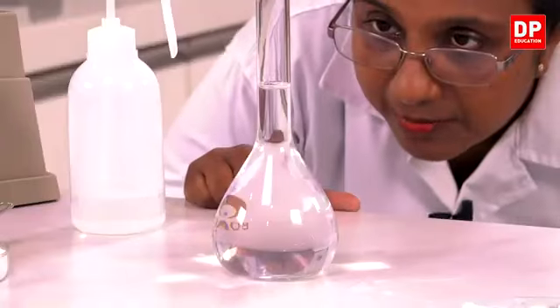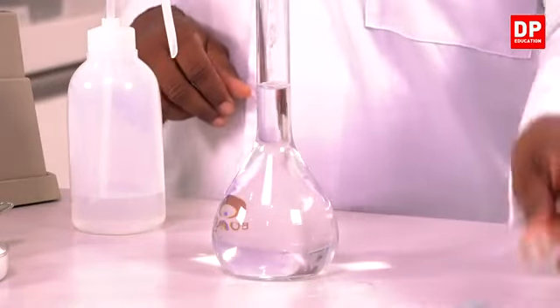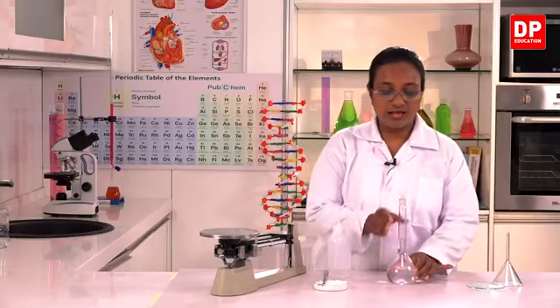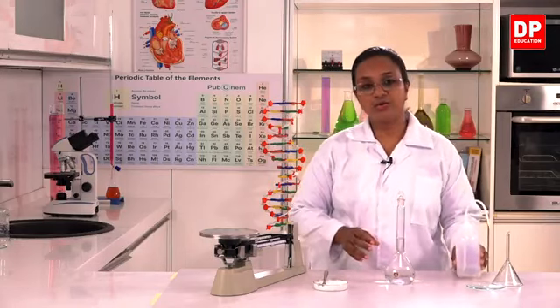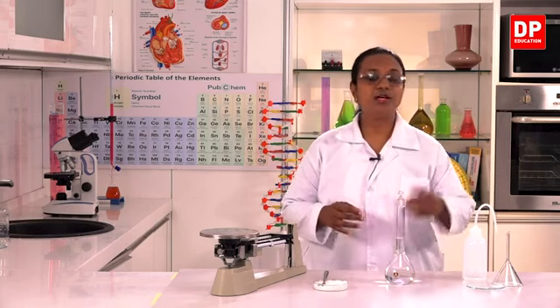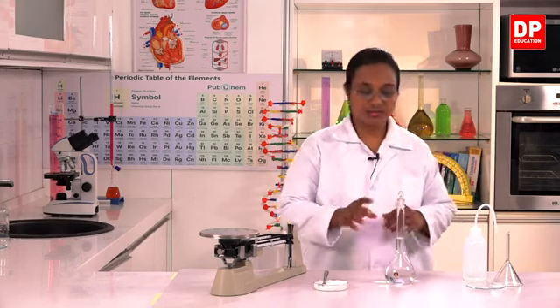So I'll again make sure that I have added the correct volume, and now I can close the lid, and I have prepared the standard solution of sodium chloride. So students, now I have added the correct volume of water, and I have to make sure that the solute gets distributed throughout the solution.